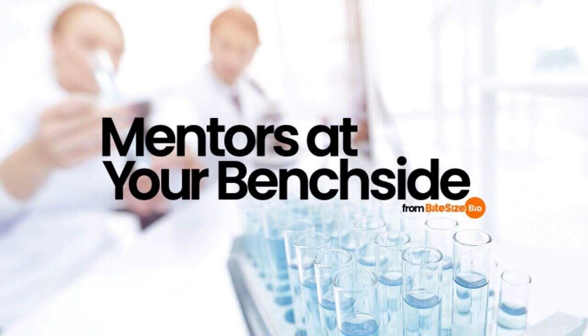Therefore, always store your antibodies as specified by the manufacturer, and ensure you store them in small aliquots to avoid degradation from frequent freeze-thaw cycles. Inquire with the vendor to determine if your secondary antibodies are pre-adsorbed. Pre-adsorption is an additional processing step where the secondary antibodies are passed through a column containing immobilized serum proteins to remove potentially cross-reactive species. Using pre-adsorbed secondary antibodies reduces the risk of cross-reactivity with non-specific targets.